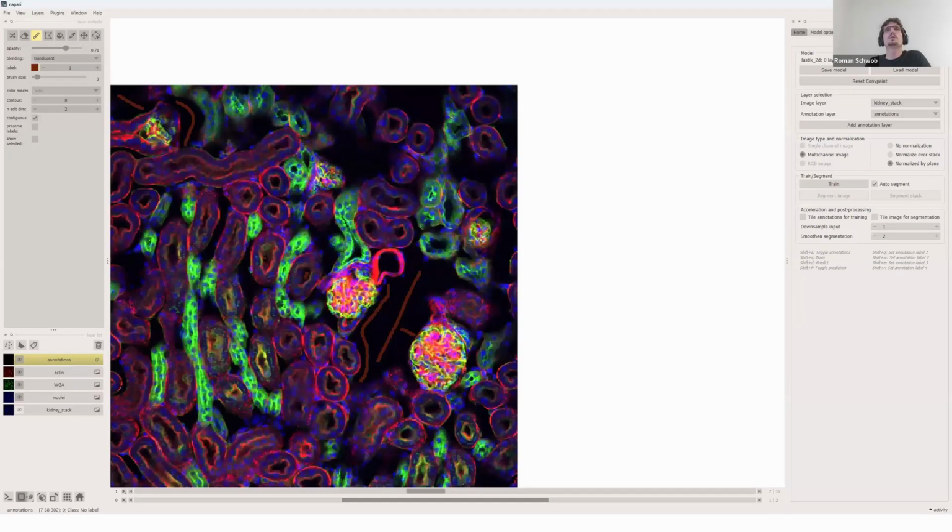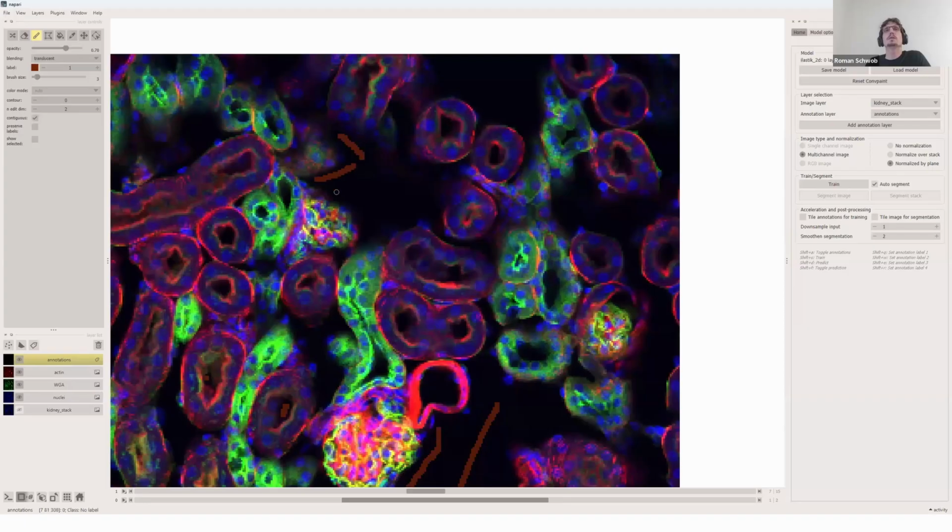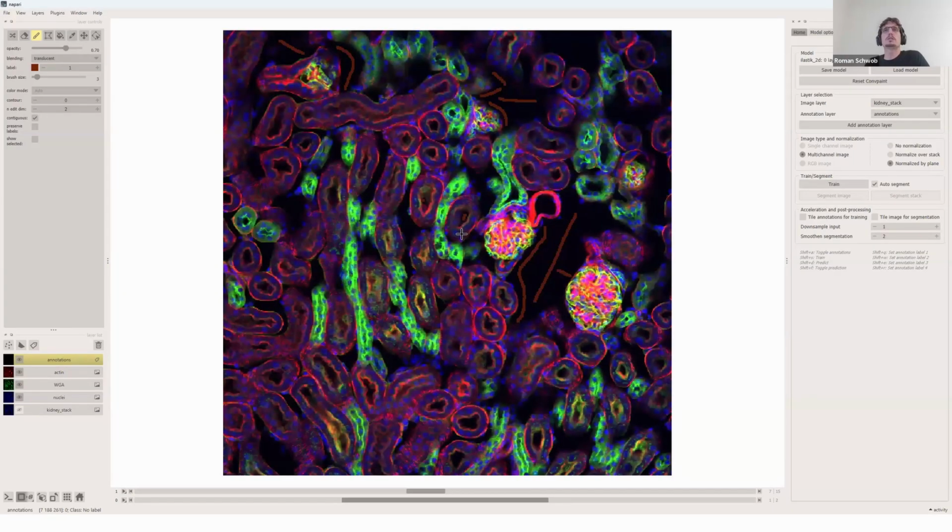And again, this would depend now a lot on what you actually want to do with your data, right? What you actually want to measure or observe. This is more like a toy example for us, but it's just to show you how we can deal with 4-dimensional data. So this would be the background.